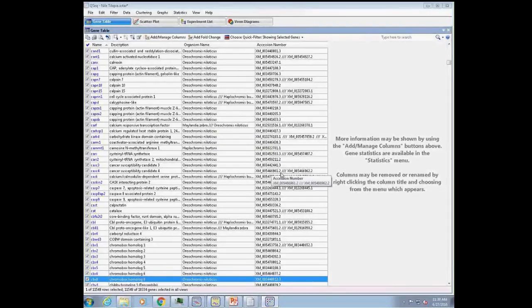And I get an accession number, which you can see is not parsed quite as cleanly. We get some of these double isoform accession numbers here. So for a non-model organism, though, this is extremely useful. Now when I do other types of analyses, having additional annotation information is really helpful.